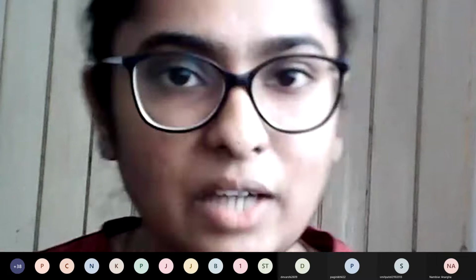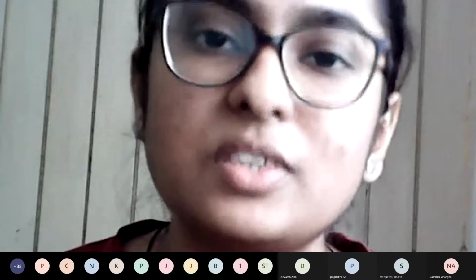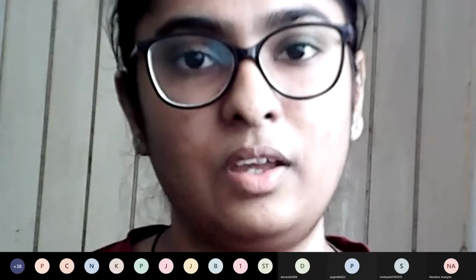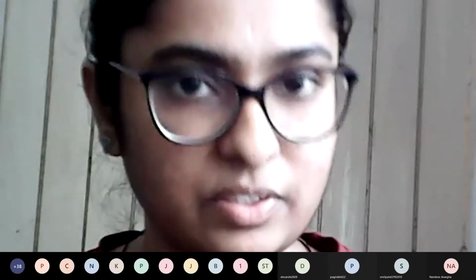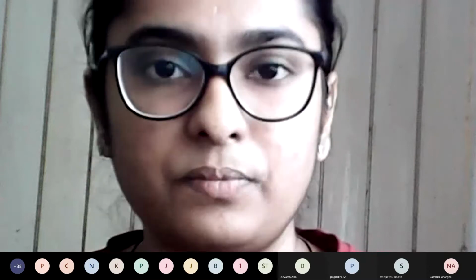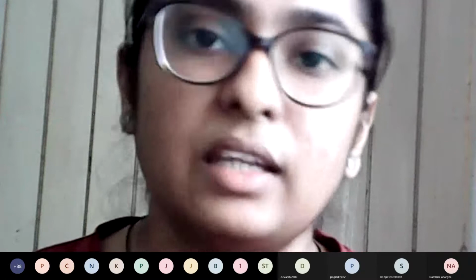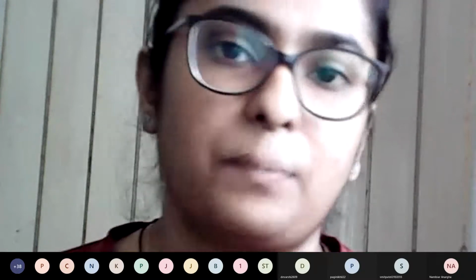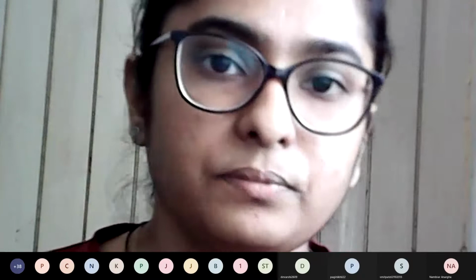So when it comes back to its free form, it comes to its original color, which is blue. So the entire color change we see is because of the indicator that helps us to know where the endpoint has come. This is what is happening. In the second case also the same thing, where we are using xylenol orange indicator.